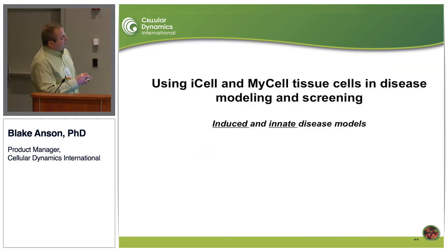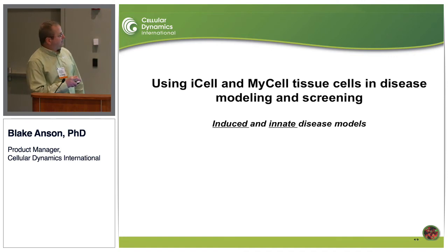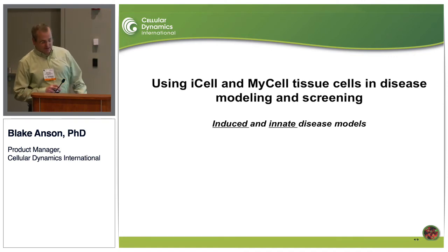All right, I think we'll give you 3 examples here of using the cells in disease modeling and screening. It's important that with access to this tissue now, you can approach it from disease models from an induced aspect or an innate disease model. So environmental versus genetic or genomic conditions.